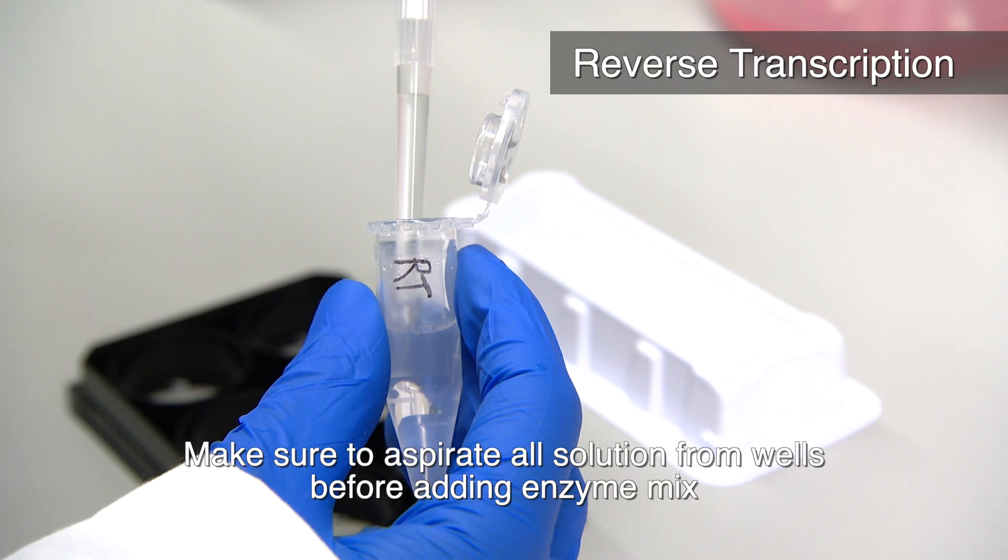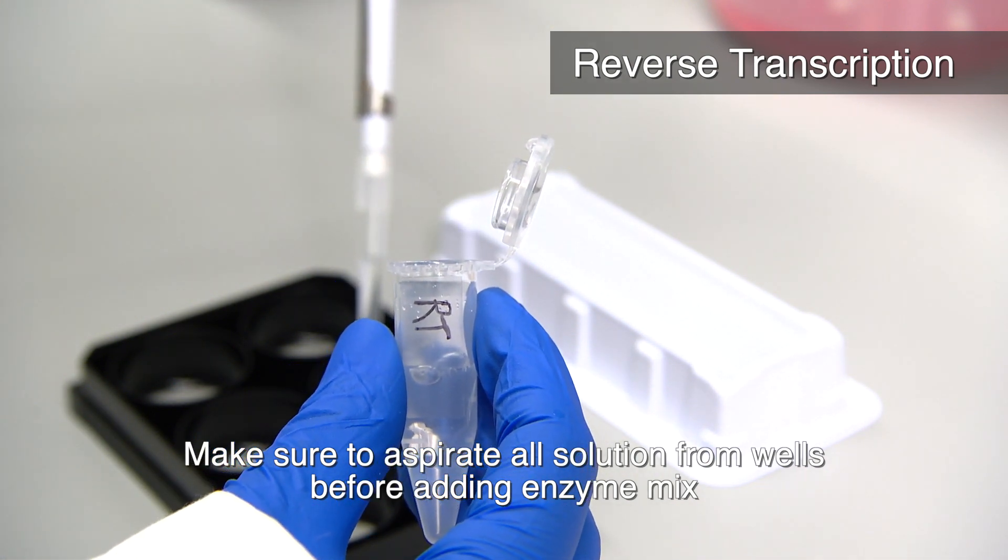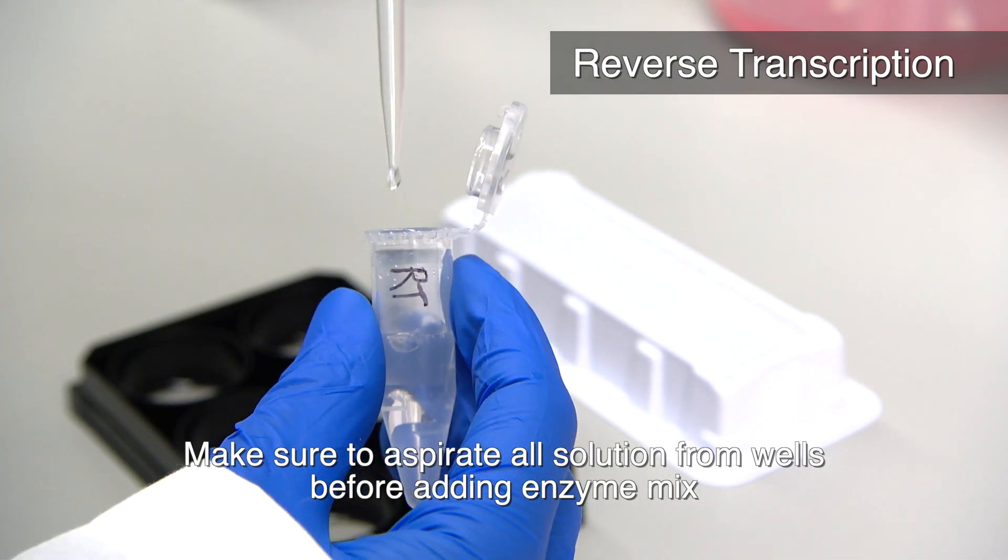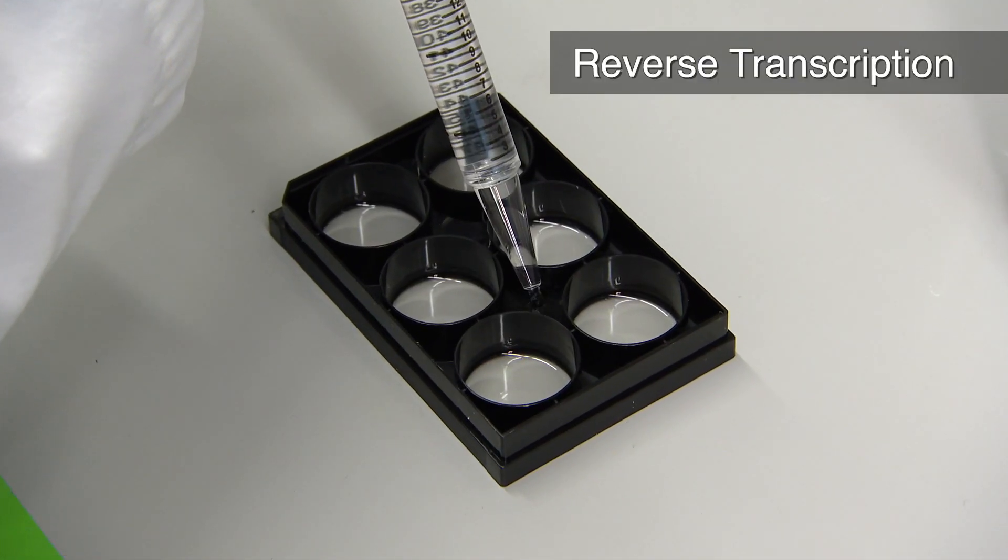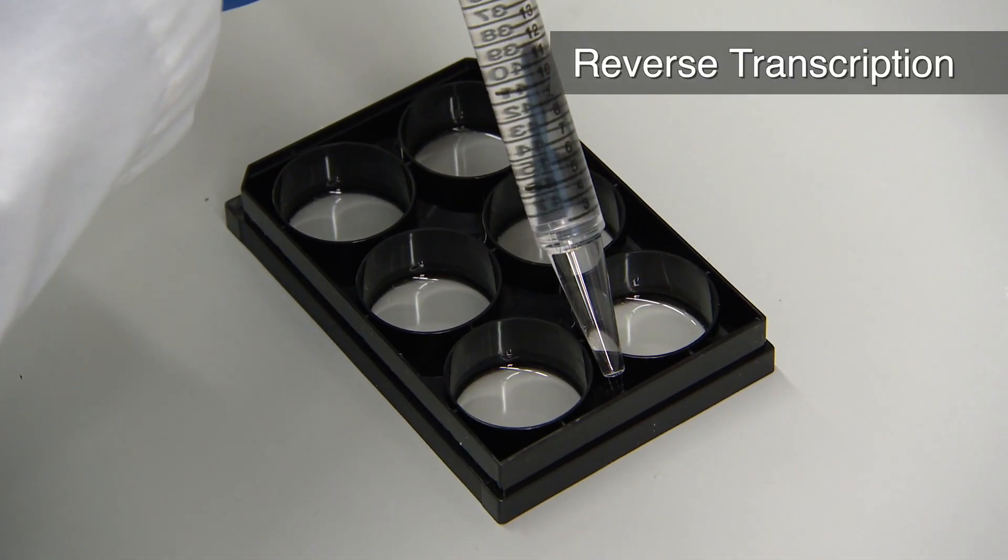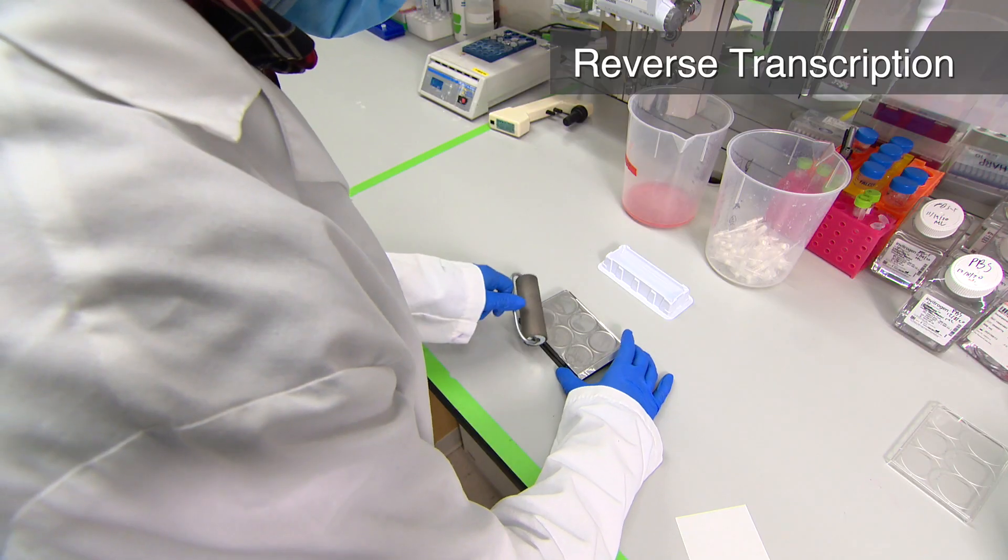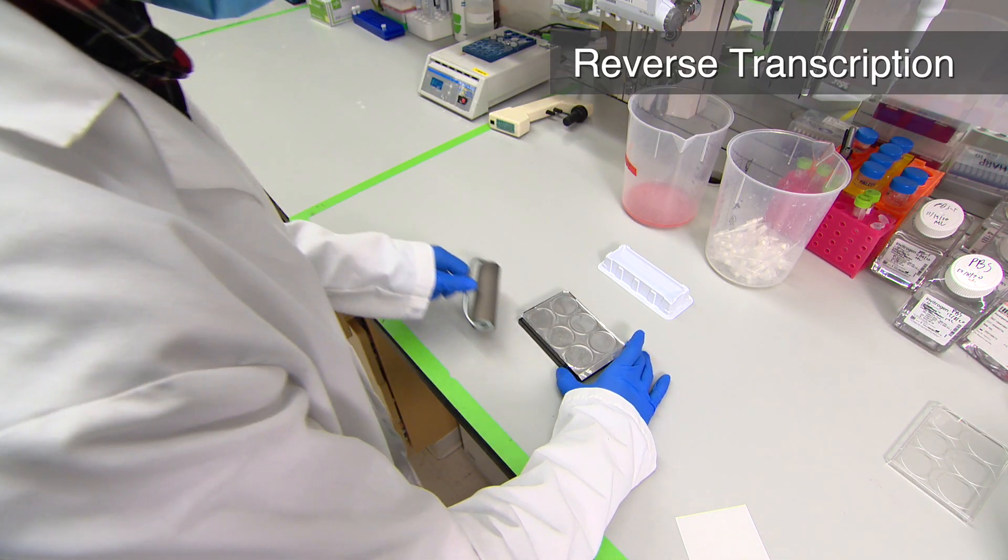Now prepare the reverse transcription reaction mix and add 750 microliters to each well. Fill the space between wells with nuclease-free water to prevent drying. Seal with an aluminum lid and shake overnight.